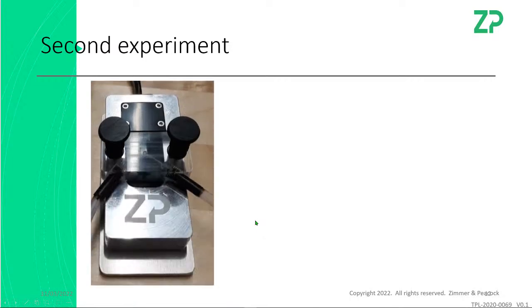The second experiment then I would say is put back on that flow cell, because now you're back into what your original question was, which is, I want to measure the dielectric properties of a suspension of cells. Okay, you can do that. You also have some comments that you want to do it in a microfluidic chamber. Well, this creates that microfluidic chamber. And you actually have a flow chamber as well.